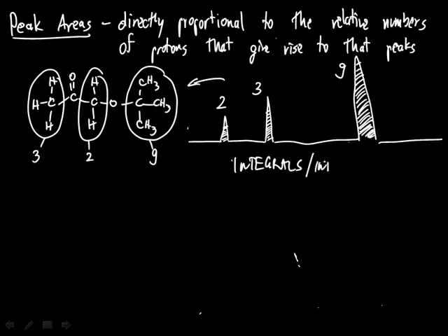or integration, because integration is basically the process of finding the area underneath some curve. And it's important to realize that these integrals really are areas underneath the peaks, not the peak height, because each peak has a certain height but also defined width, so it has a roughly triangular shape, and from that triangular shape these numbers can be extracted.